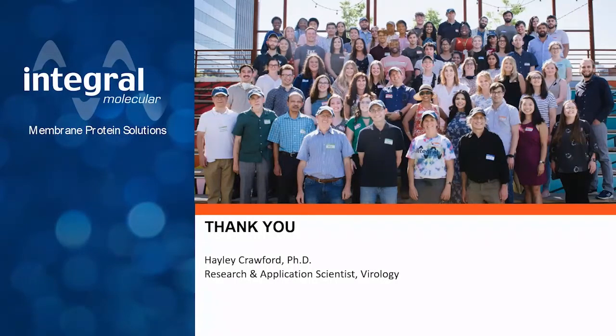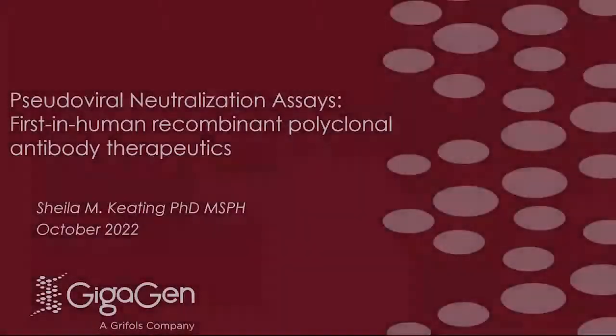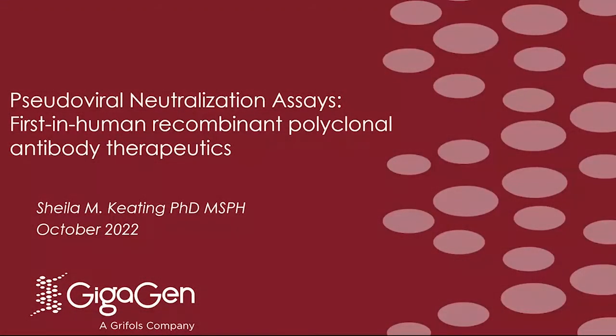Sheila Keating from Gigagen. Hi, my name is Sheila Keating. I'm the Vice President of Immunology at Gigagen, a subsidiary of Grifols. And today I'm going to talk to you about our pseudoviral neutralization assays and how we use them to develop our first-in-human recombinant polyclonal antibody therapeutic for SARS-CoV-2.